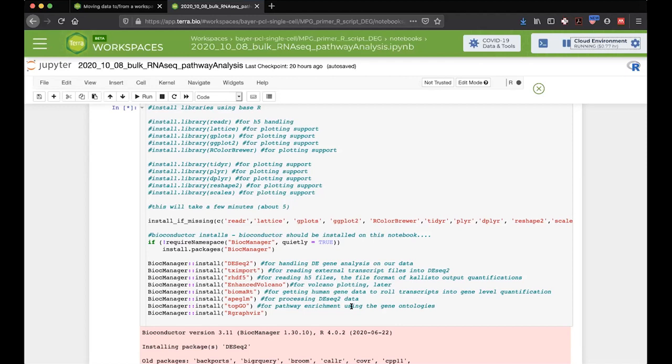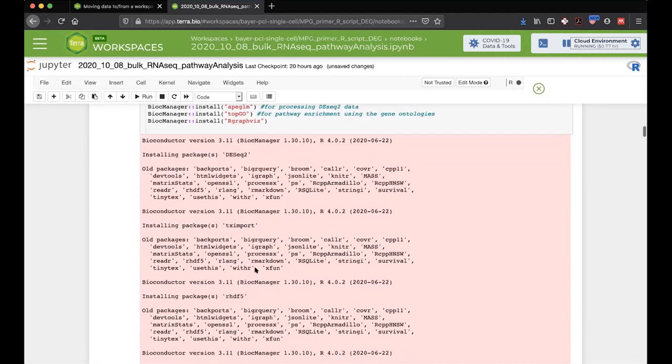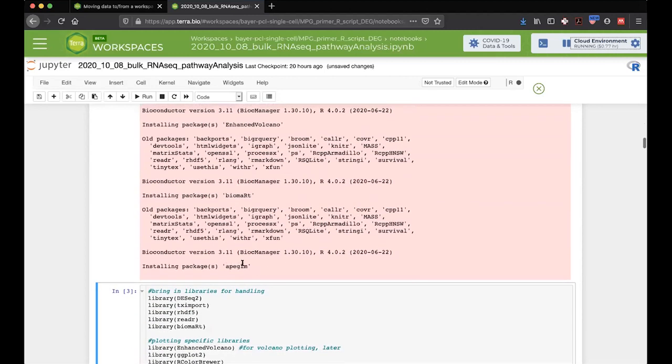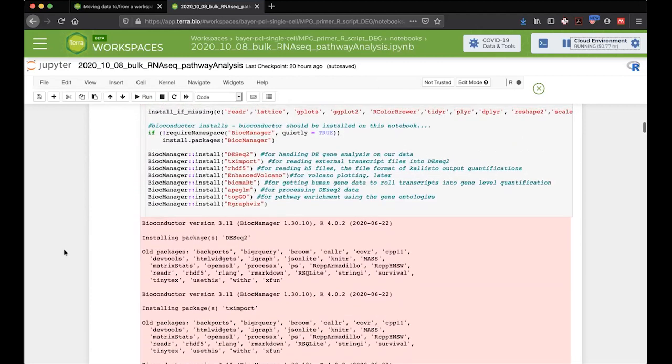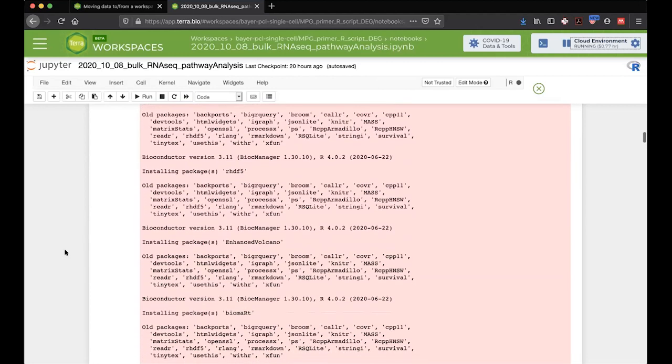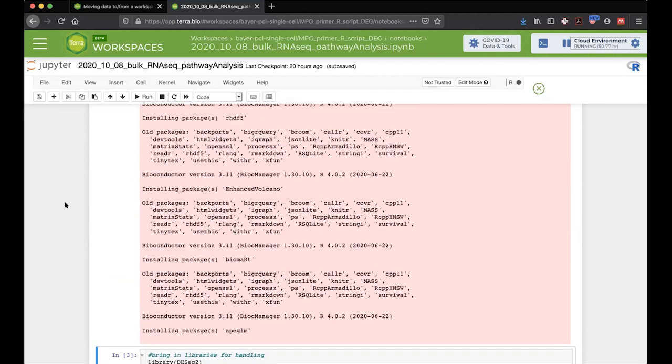Okay, so this is still running, and you can see that it'll take us a couple more minutes, but we're already down to the general linear model package, which is our third to last. And it's just installing dependencies for everything. I think it's cool. This is really pretty fast for the fact that you're paying less than $1 an hour. So we're going to get a lot done for, you know, everyone's 77 cents.